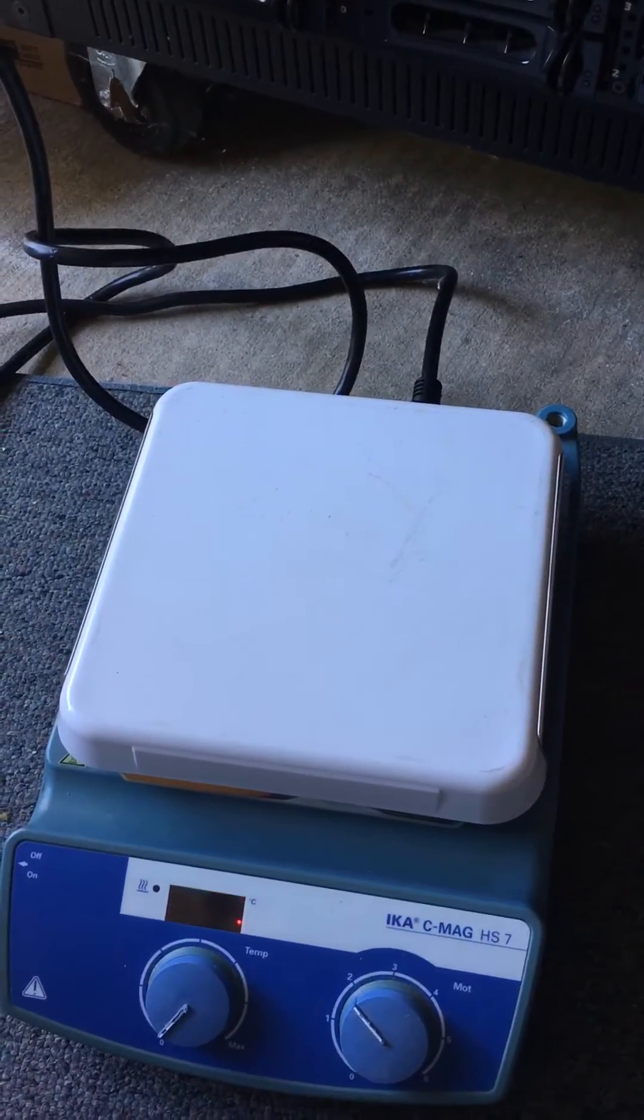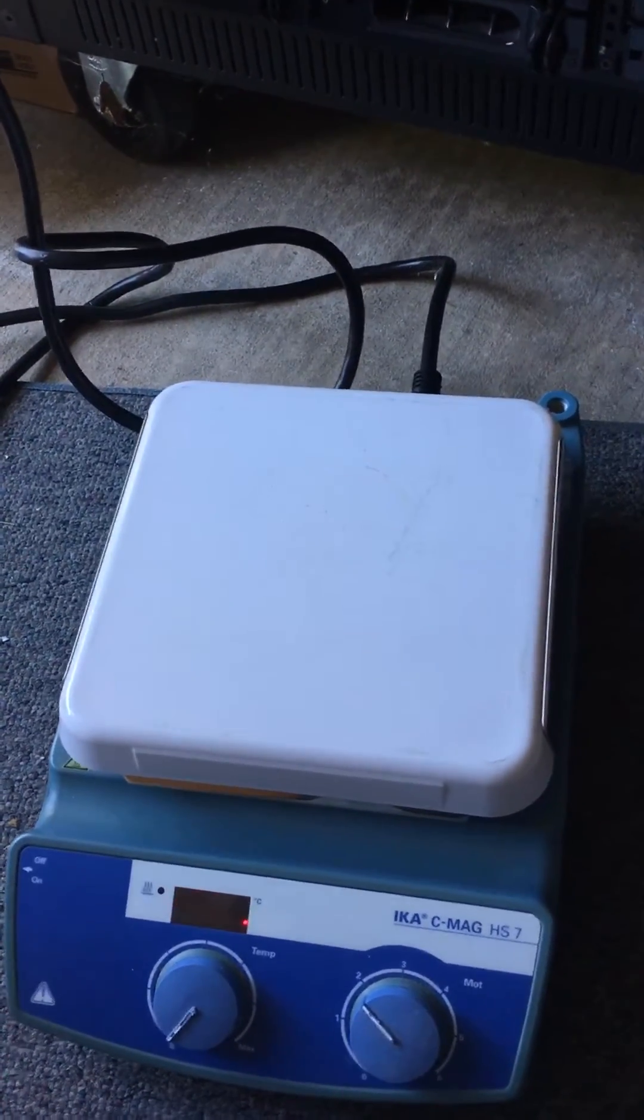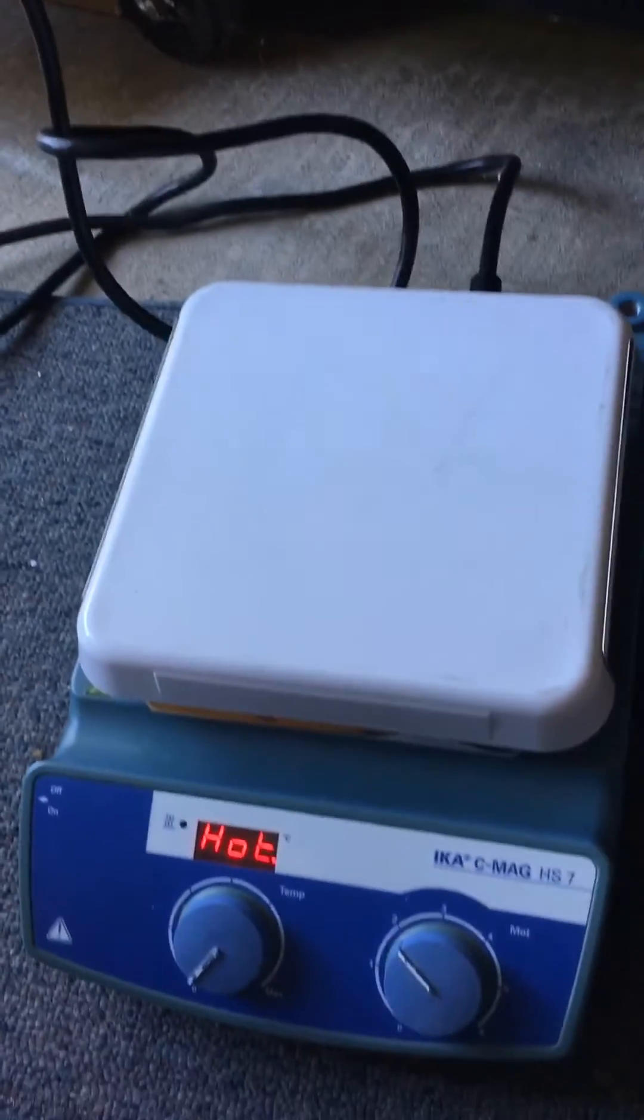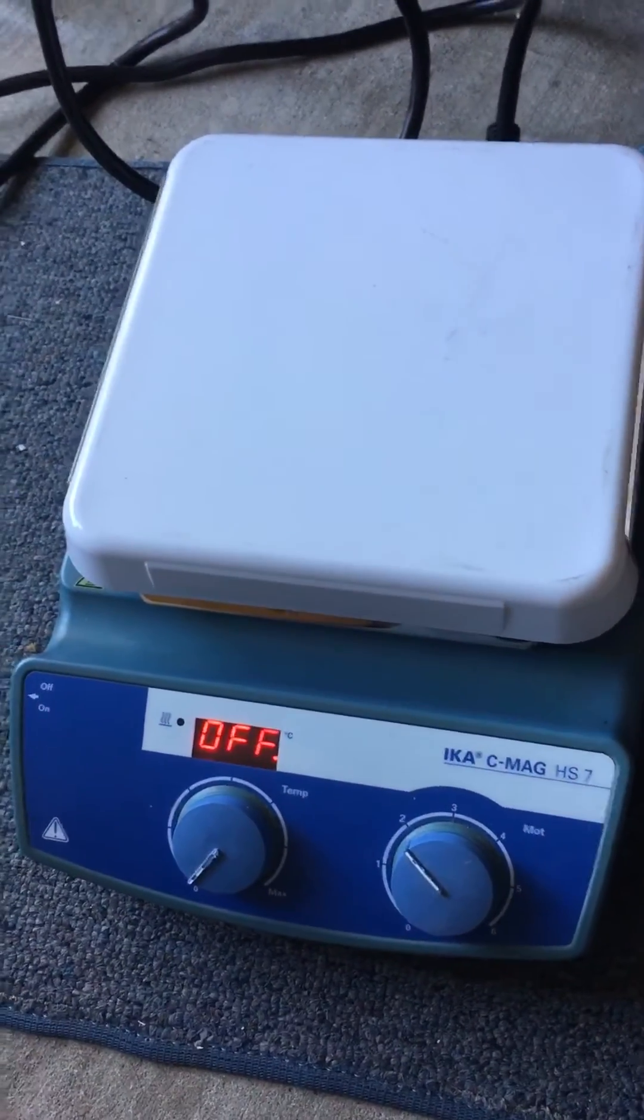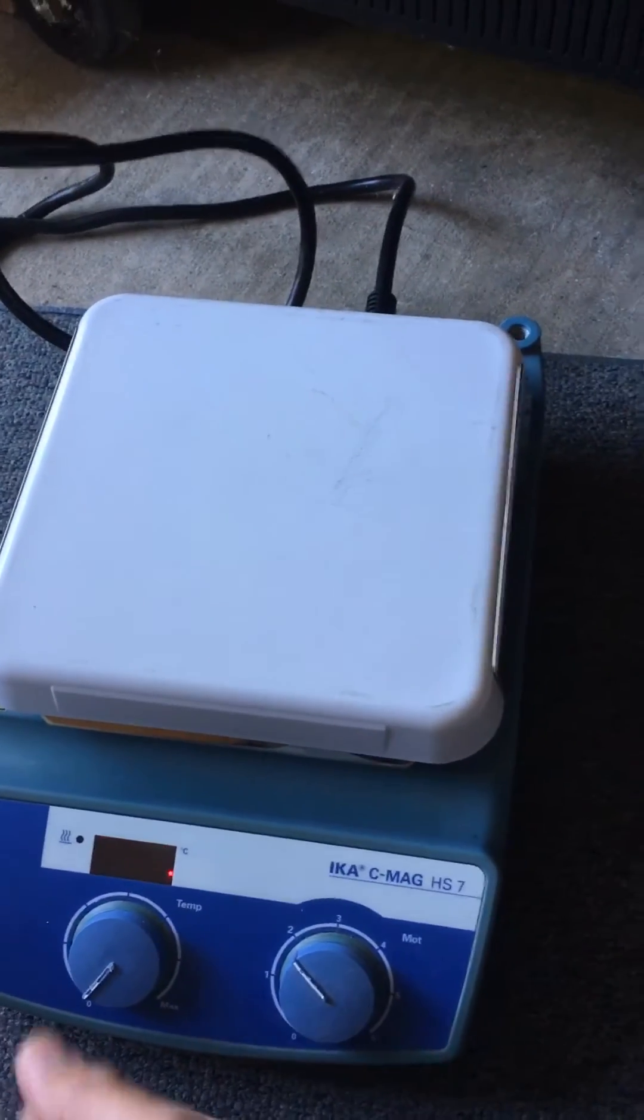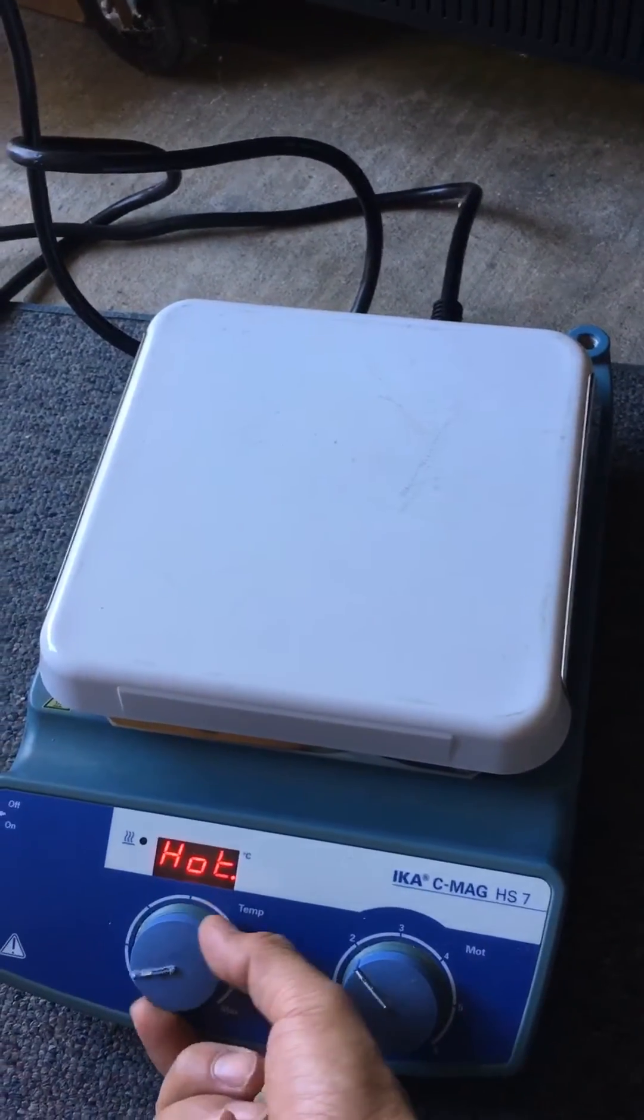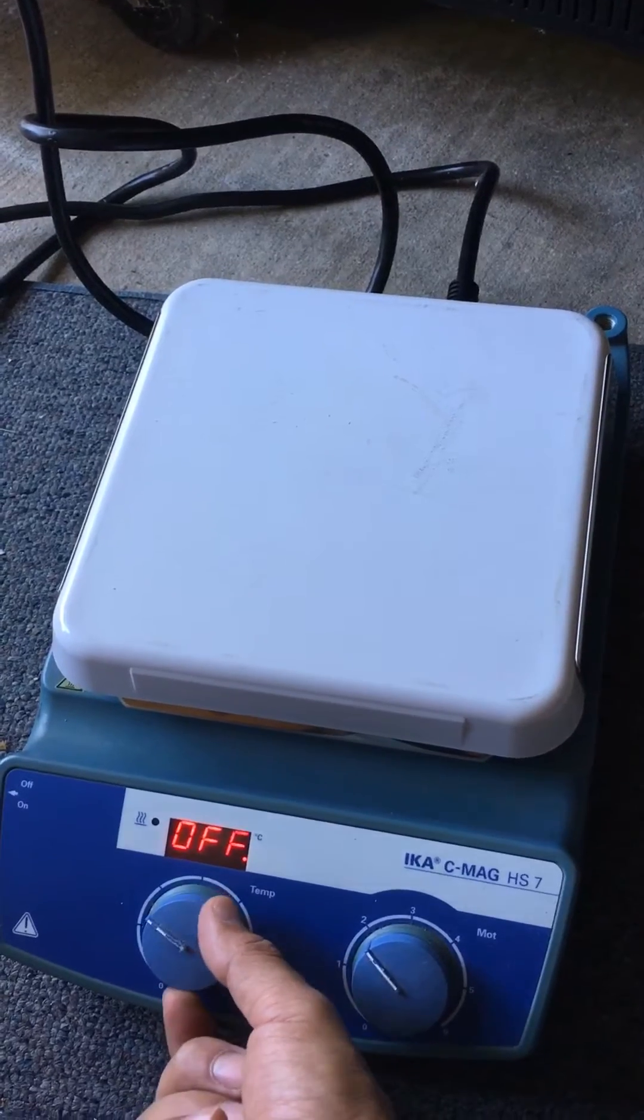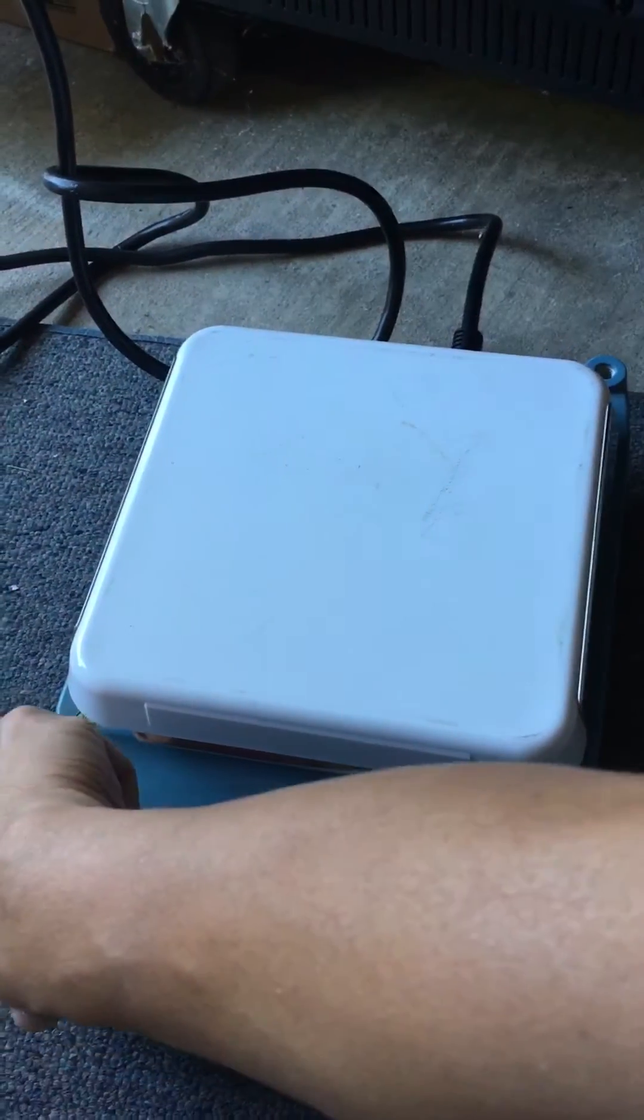This, of course, is to stir mixes, to stir liquids. And this thing gets hot really fast. We had it on for a while and it got hot really fast. Let's turn it on.